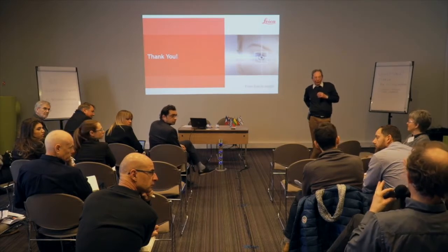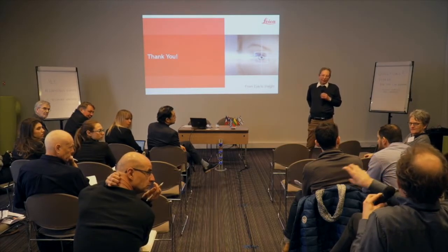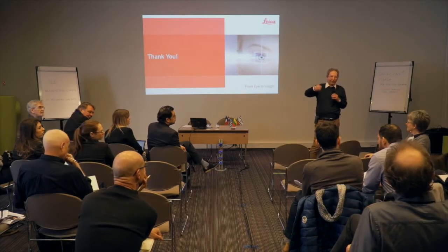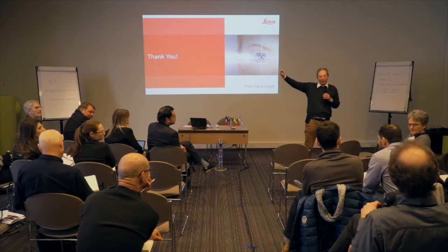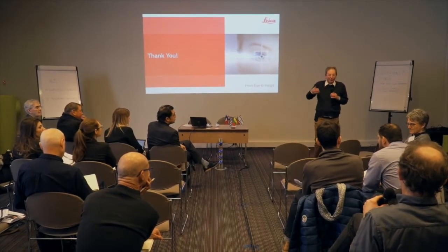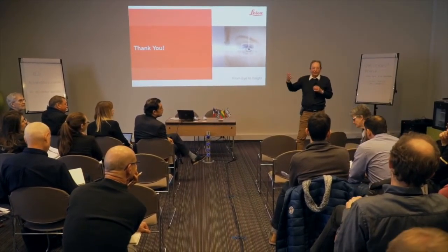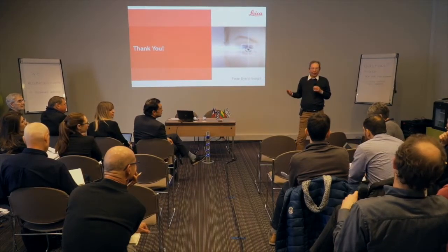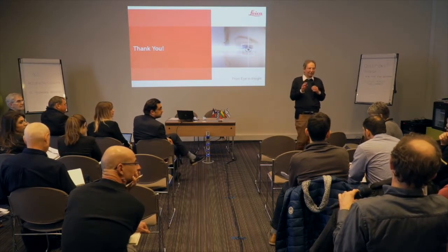You say, this is a trace as a unity, and I extract some summarizing data from that trace and put a summary into the database. But still, you have dimensional data, you have color point data, and so on. So you have a whole set of data. Of course. I know that because we have long experience, for example, in the automotive industry, where we use a thing called cleanliness expert, which does particle analysis. But the sheer amount of data is what still shocks me.